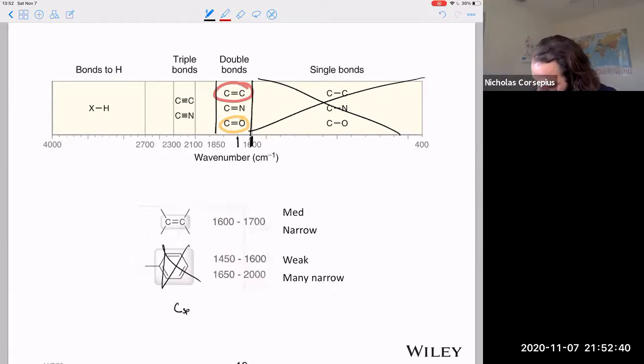I'd instead look at the sp2 carbon hydrogen region to assess that. Because again, the carbon-carbon double bond in a benzene ring just doesn't give you a very good signal. I think people who are super trained in IR can spot these a little bit better. For me personally, I don't think it's very easy to spot the benzene ring in this particular region.